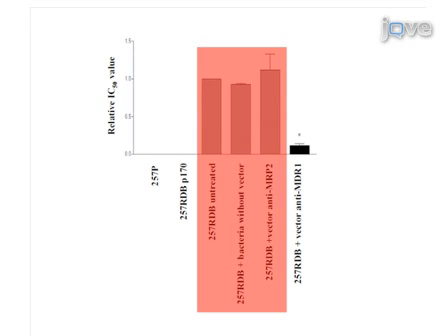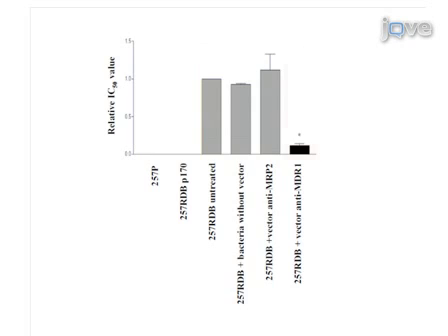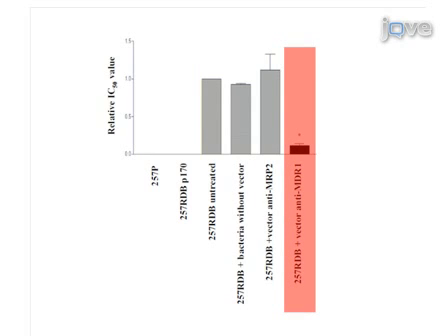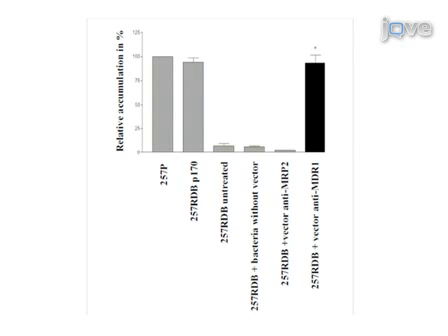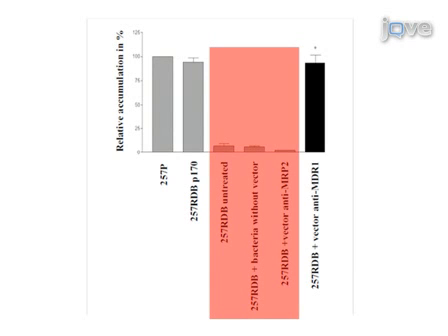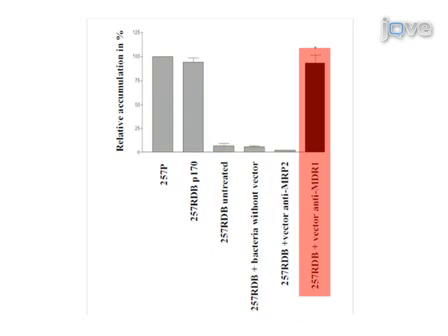While a drug-resistant cell line does not respond to the cancer drug daunorubicin, the same cell line infected with bacteria transformed with an anti-MDR1 shRNA-expressing plasmid is sensitive to the drug. Finally, in an anthracycline accumulation assay, the drug-resistant cell line showed little cancer drug accumulation, which was reversed in the drug-resistant cells treated with the MDR1 shRNA.